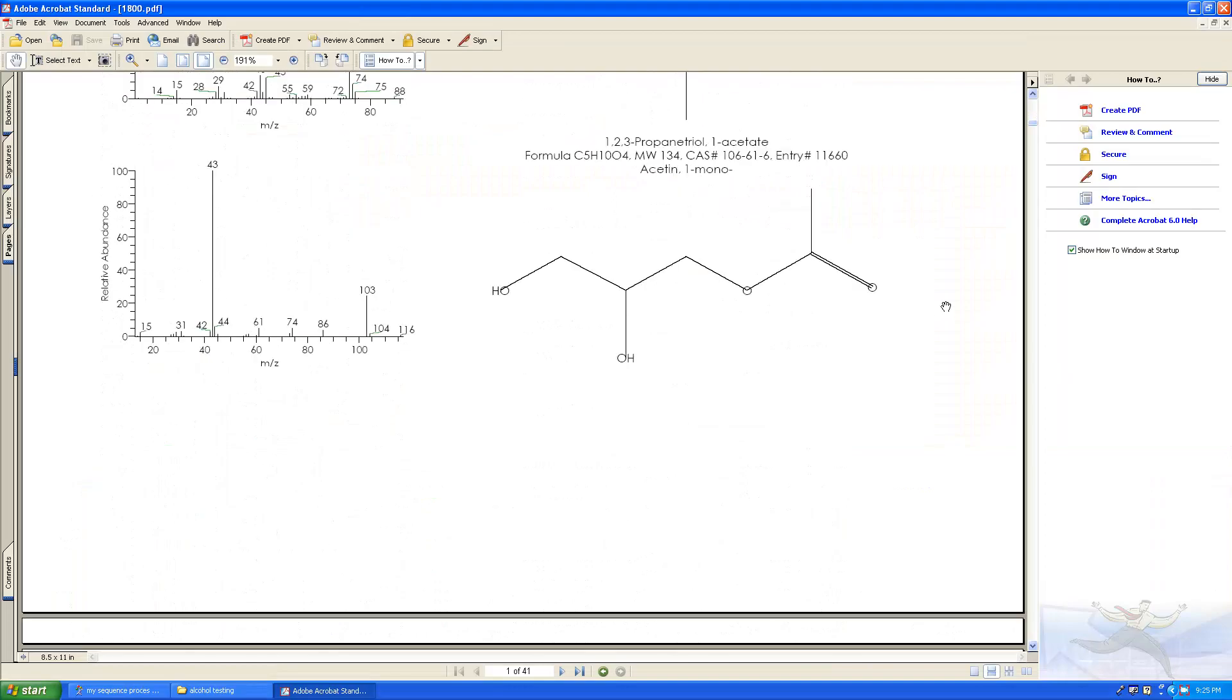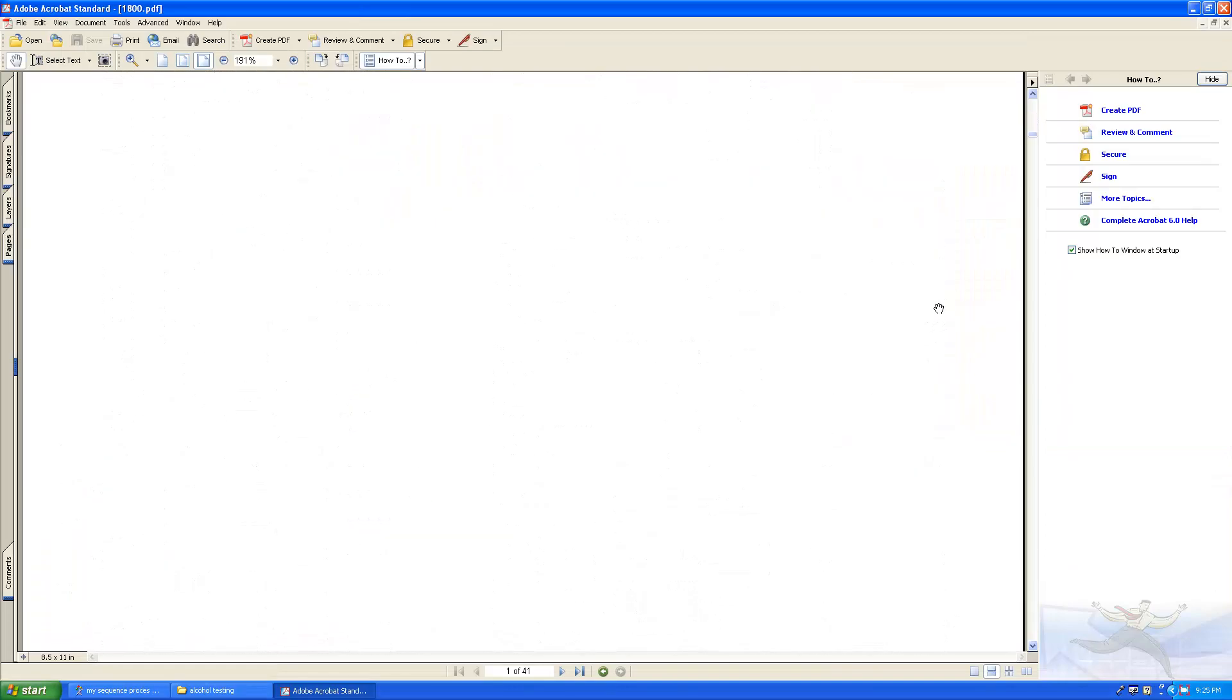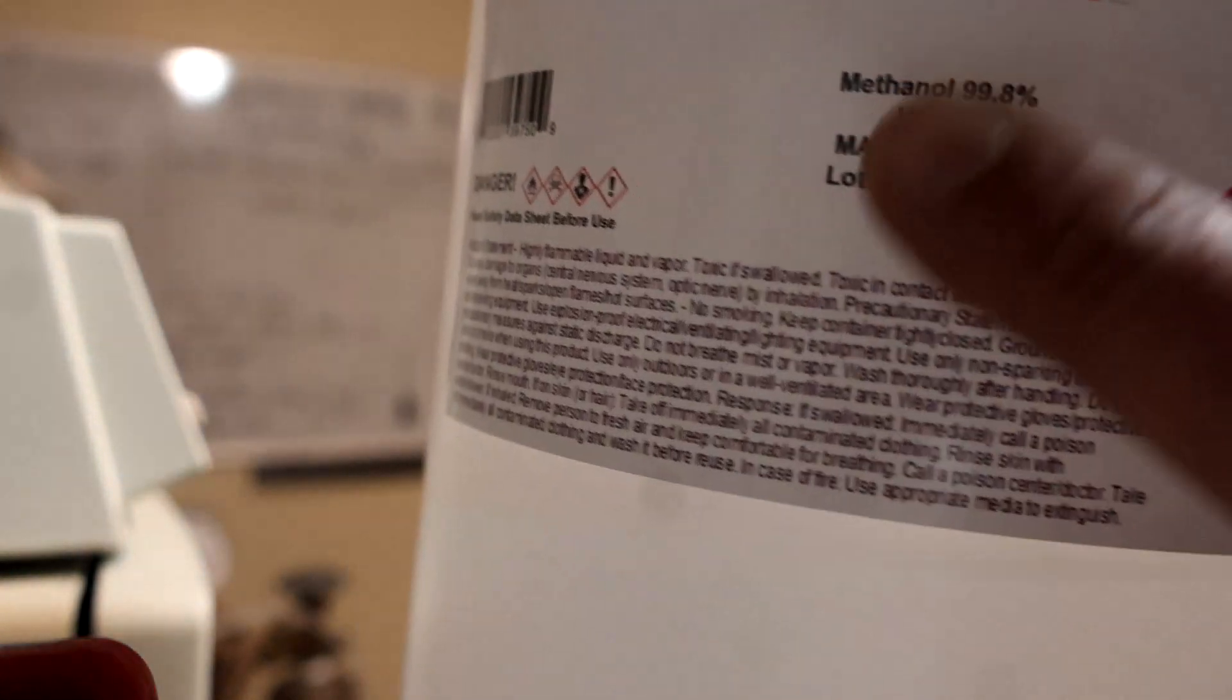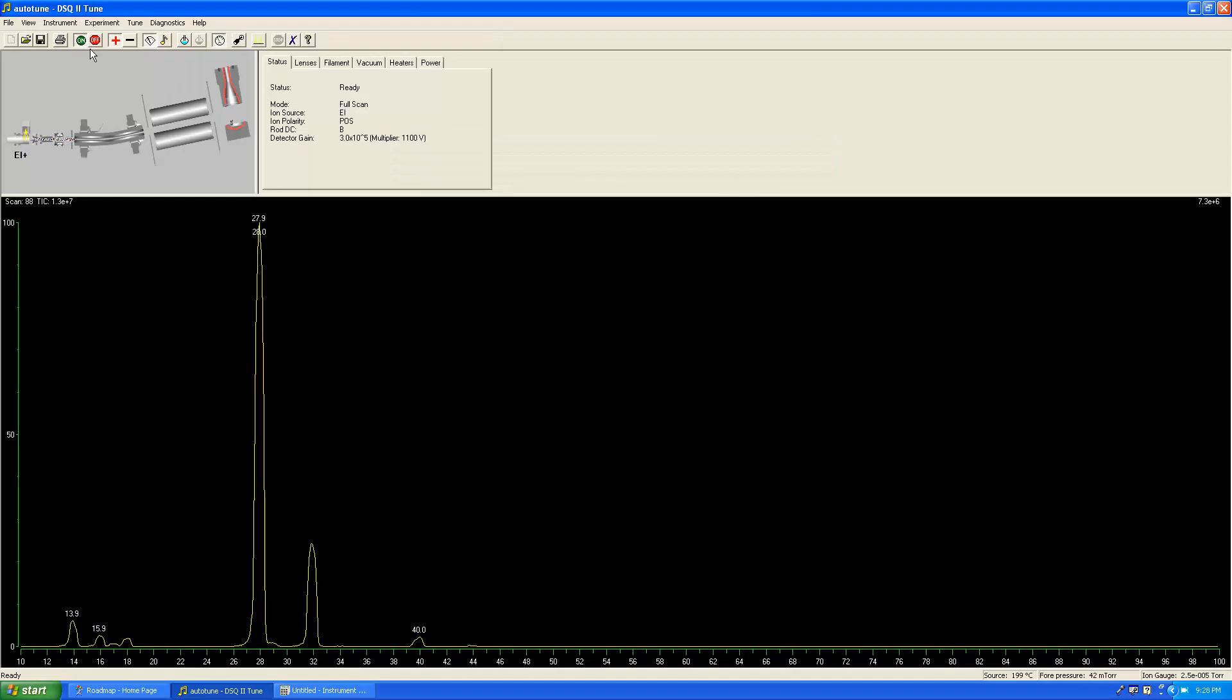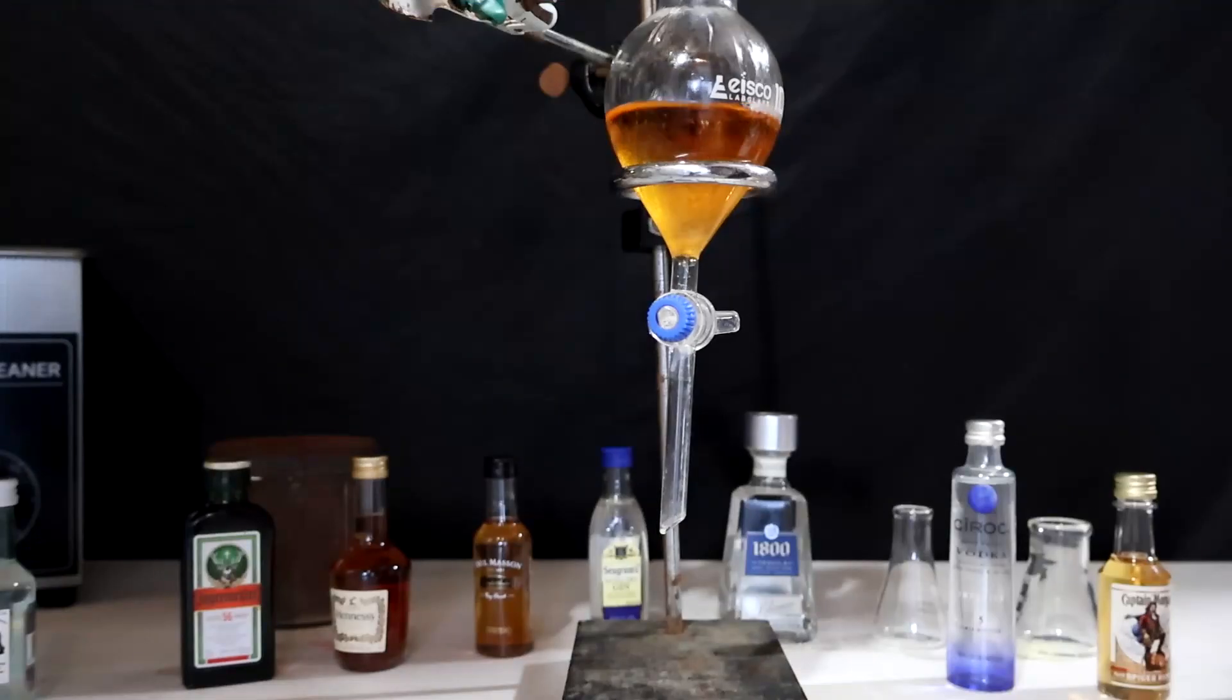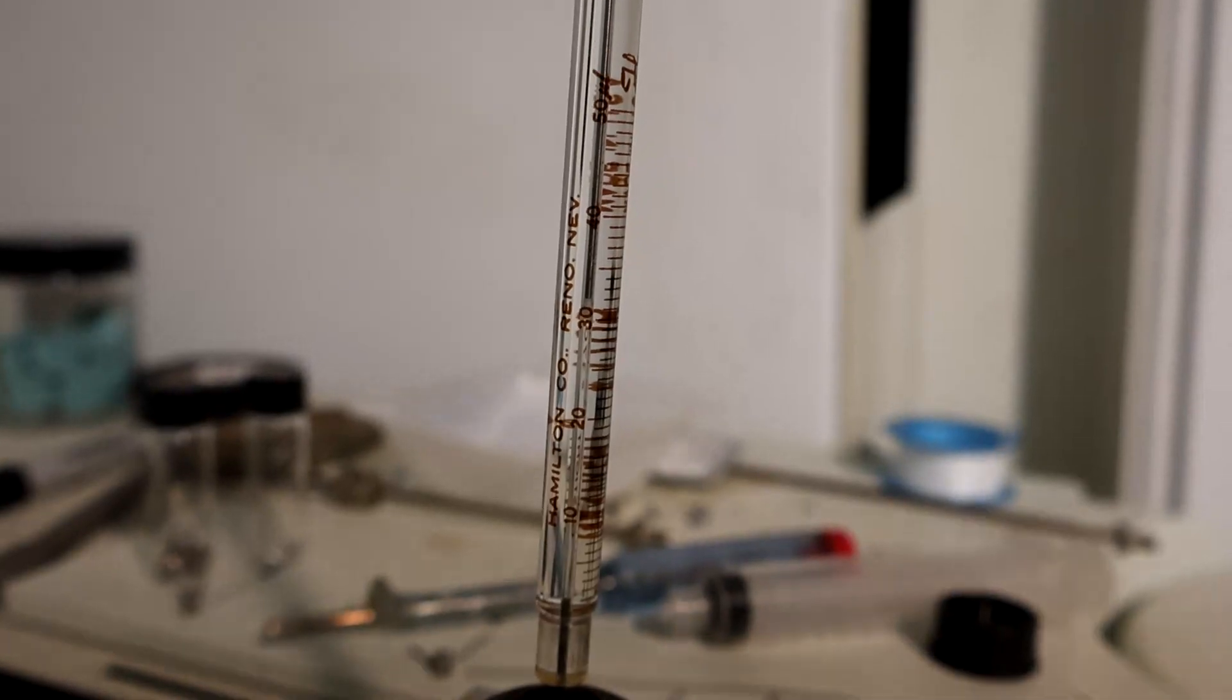Keep in mind that some molecules are also a bit sticky and difficult to get rid of from one injection to another. Also, my solvents are supposed to be HPLC grade but obviously contain impurities in the form of tetrachloroethylene in my DCM, and I suspect my methanol to have traces of toluene and xylene.